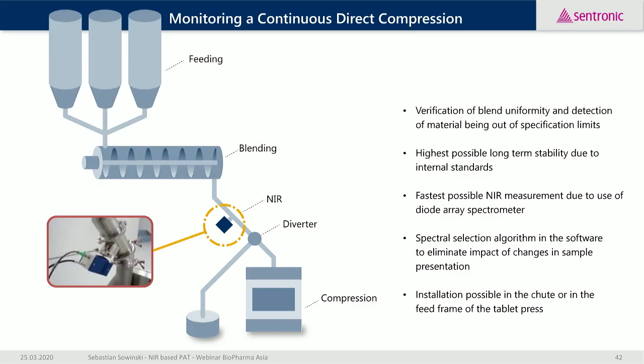Here we have the challenge to handle a sample presentation which is not the most constant one. Sometimes there is some pulsation in the amount of material due to characteristics of the blender outlet of the transfer into the line.